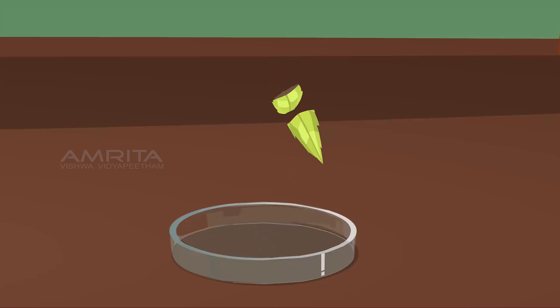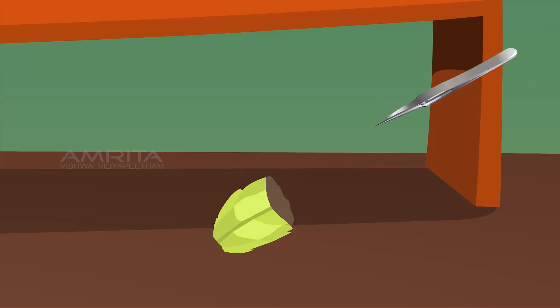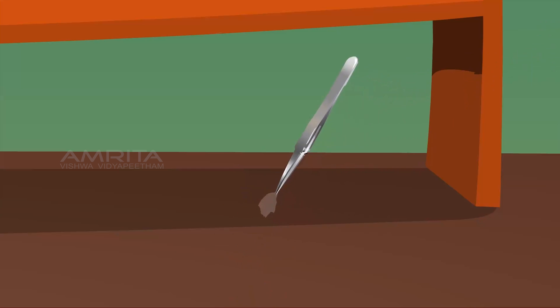fold it and carefully tear along the bruised area on the lower side of the leaf. We can see a colourless narrow border along the torn edge. Carefully pull out the thin membranous transparent layer from the lower epidermis using forceps.